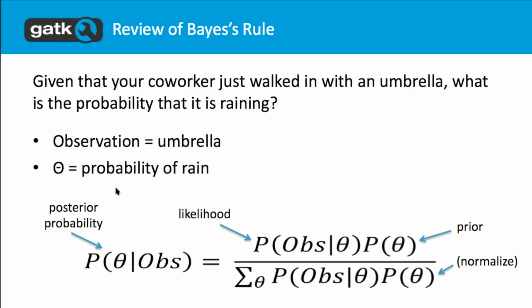And we're going to do the same thing with our genotype assignments, where if we have, for example, a homozygous variant call for a variant where that particular allele is very rare in the population, we're going to be more skeptical that we've actually found a person who's homozygous variant, because it's just less likely.